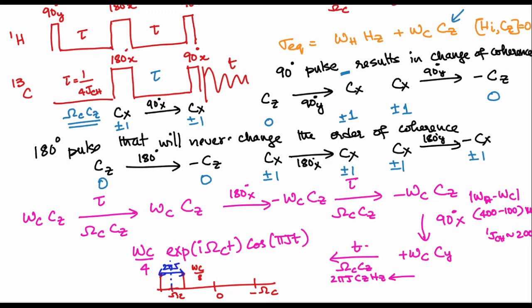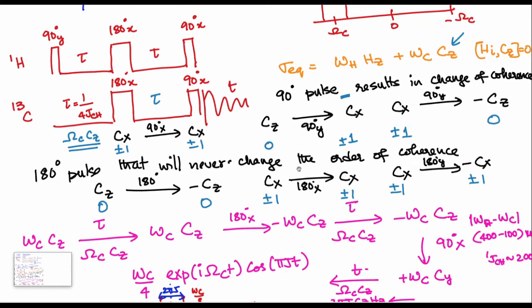So now let's go back to this INEPT module. Instead of just looking at the carbon portion, now we'll look at the proton portion.